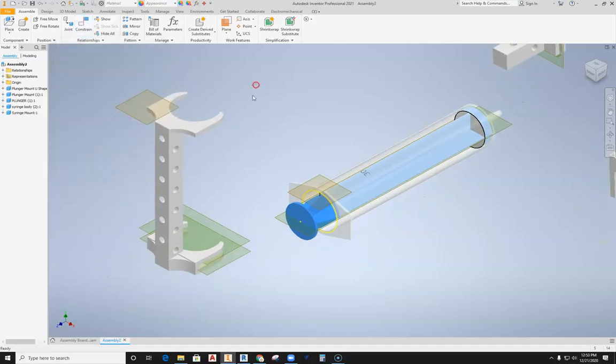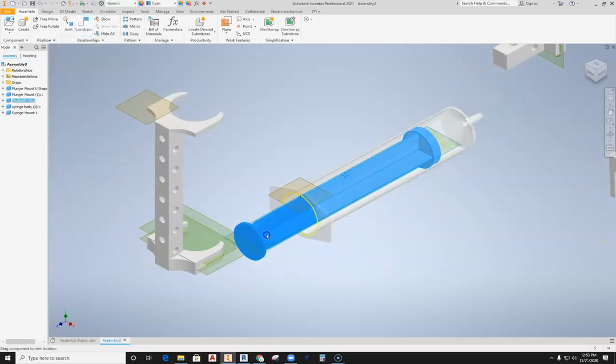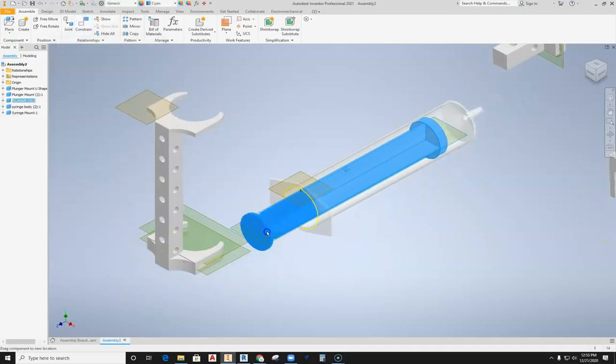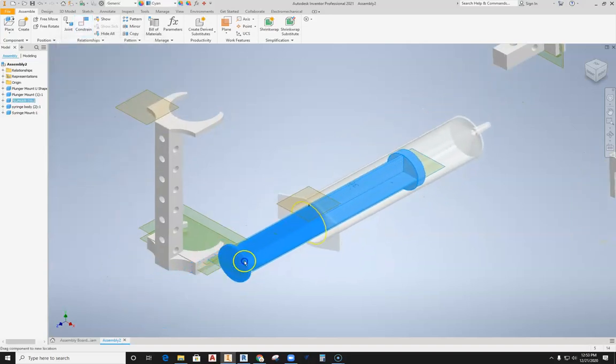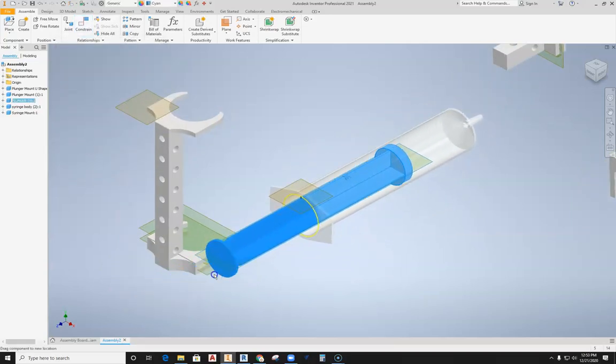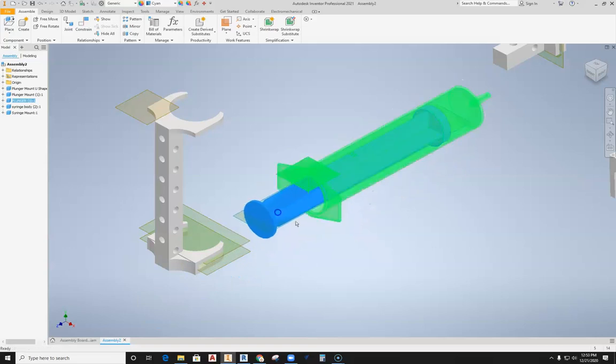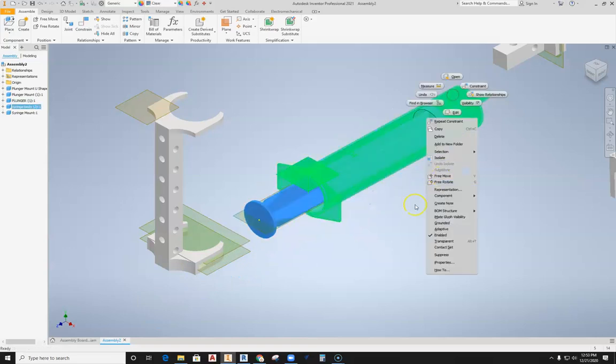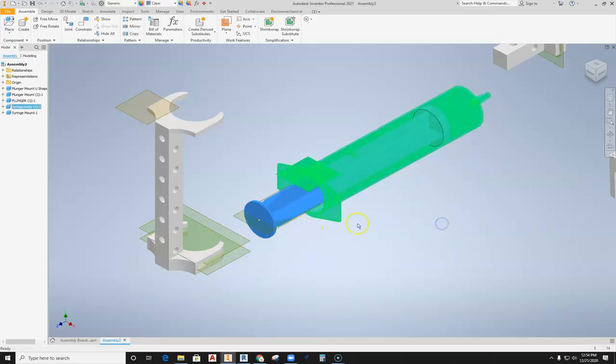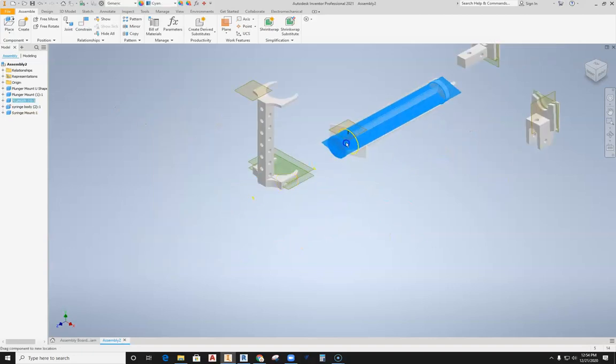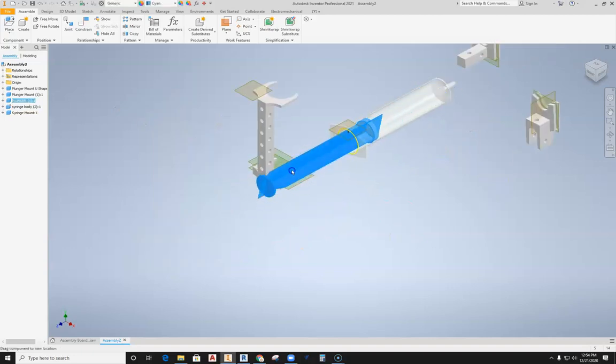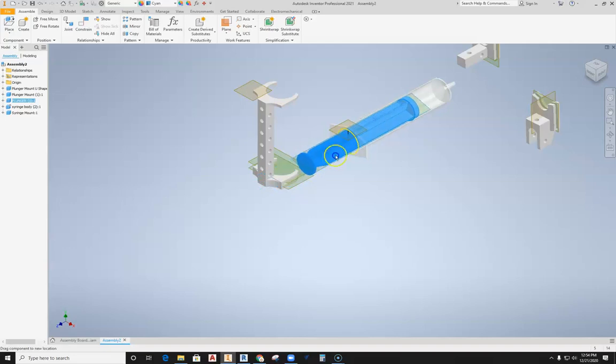Now the other syringe is also floating, so let's ground that. We'll right-click and hit grounded. Then you can really see how this is going to move, and then you can see it actually spins. Well, that's actually the motion that occurs in the plunger, so we can leave that be.